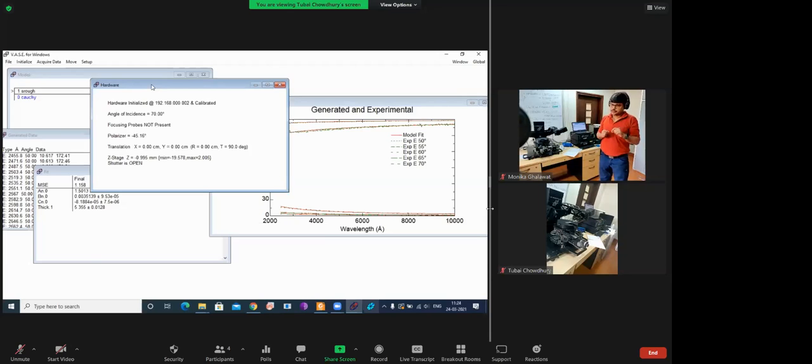You have the value of n at only a few wavelengths, for example 5 or 6 different wavelengths, and those n and lambda parameters fit that Cauchy model. It helps you in industry, because it is fitting that wavelength window, so you can find another n value for some other lambda which falls into that region. So you can basically do the calibration. You don't need to do the entire measurement. There is no physics behind the Cauchy model actually.